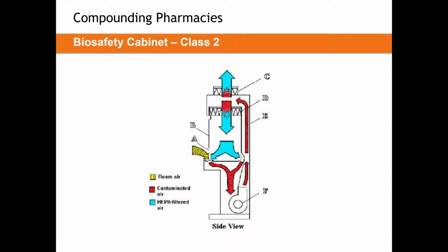And the claim I'd like to make here is this equipment in your most critical space, which is your hazardous drugs mixing space, this piece of equipment essentially drives your design. And the reason I say this is the way the exhaust from this machine is handled is what drives our exhaust and supply system. This is what's going to dictate the operation of the controls. And the reason I say that, there are three distinct ways to operate these exhaust systems.